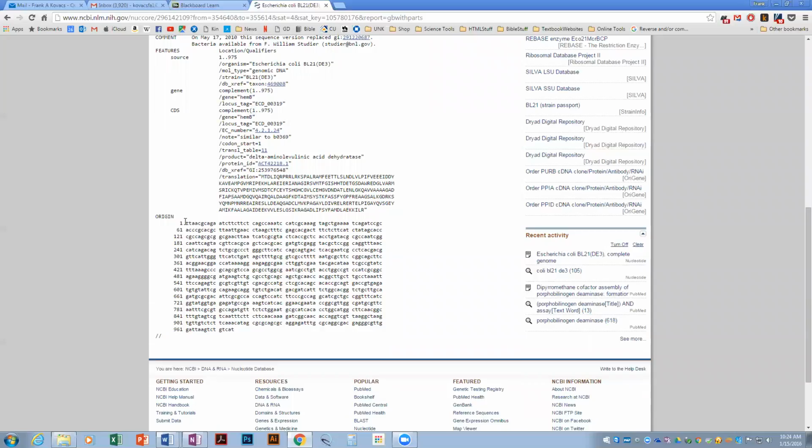But you'll notice this starts with TTA, not ATG. What's up with that? Well, if you look down at the end, you say, wait a minute, going backwards, it is TAC. What would be the complement of this? Going in the reverse direction, the complement would be ATG. So what you see here is the complement of our gene sequence. What we'll need to do, and I'll demonstrate this with this sequence, is generate the reverse complement of this sequence in order to work with it.